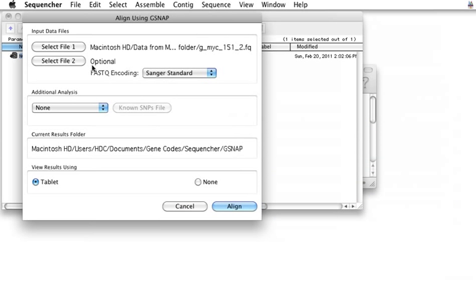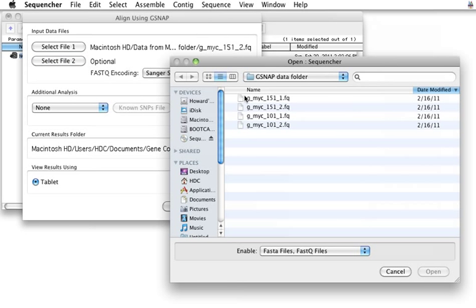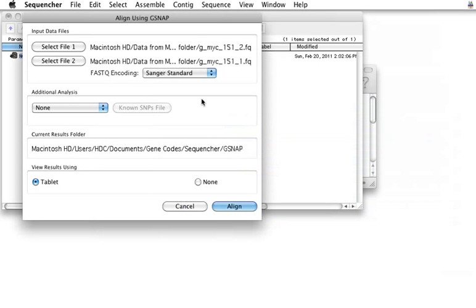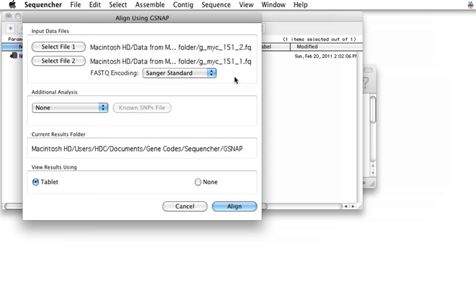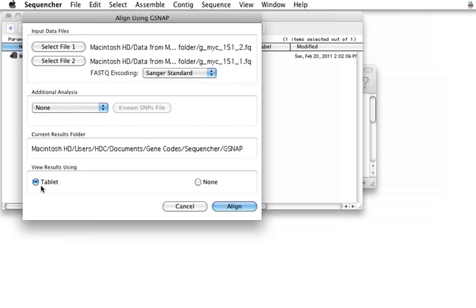So I'll take one set, and I'll select my second set. If you're familiar with the issues regarding quality scores, you can choose Sanger Standard or Illumina quality scores. I'm not going to do any of the additional analysis, such as SNP-tolerant alignment from a table of known SNPs, or looking for methylation points based on bisulfite-treated DNA. But I am going to open this automatically with another program called Tablet.